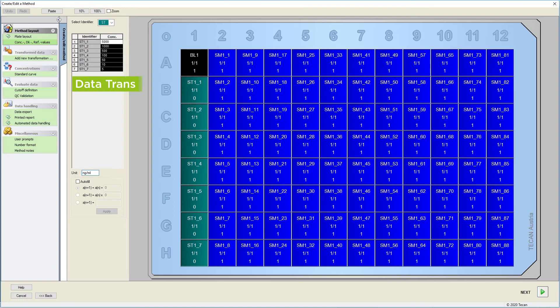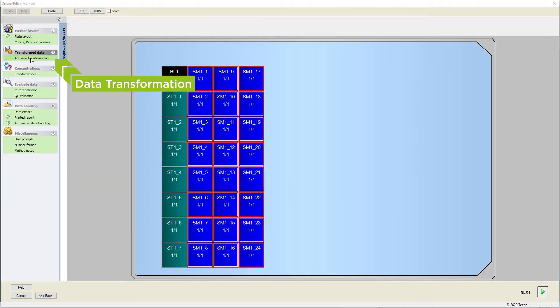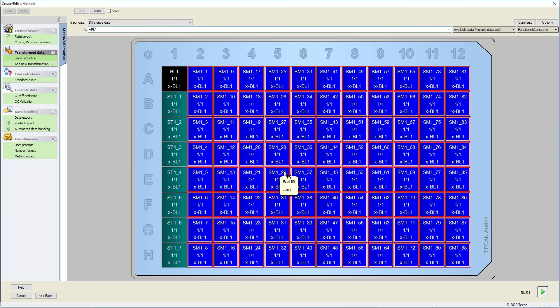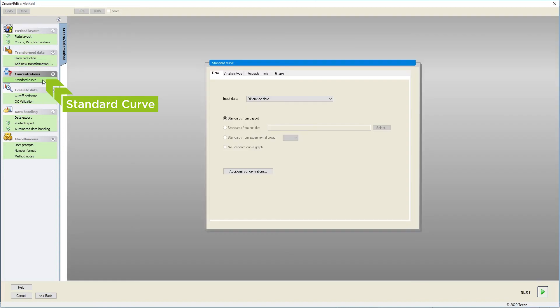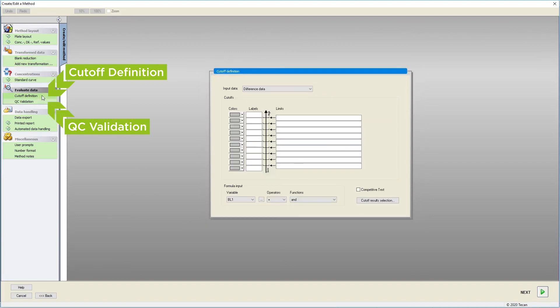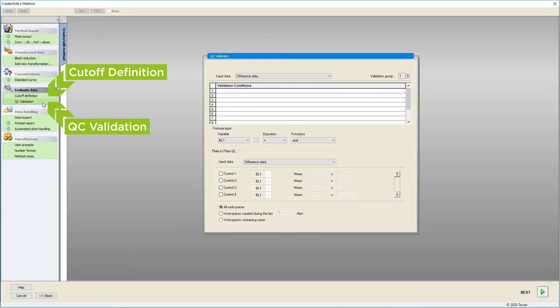We can use Magellan software to define data transformations, for example, a blank reduction. We can also use the standards we have defined to create a standard curve. And you can define cut-offs and QC validation criteria to easily discern differences between samples or to check for assay validity.